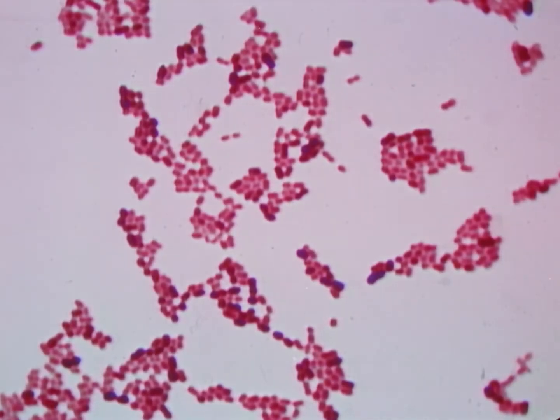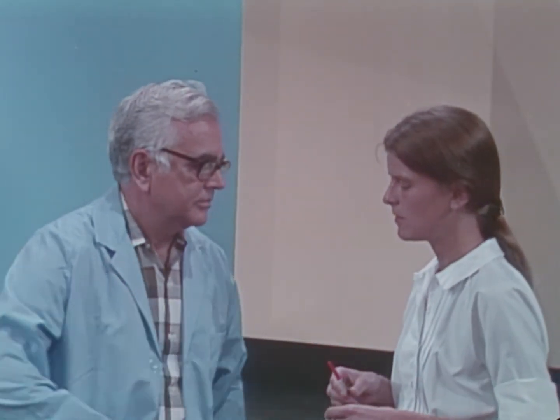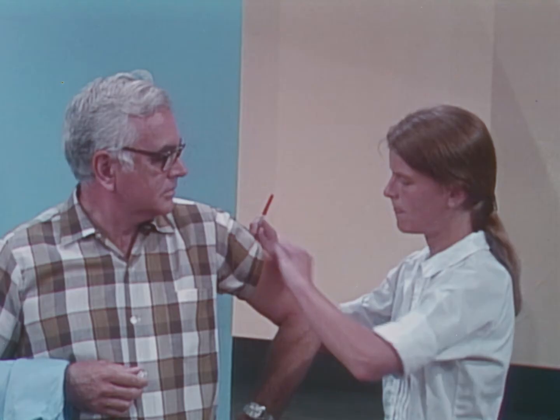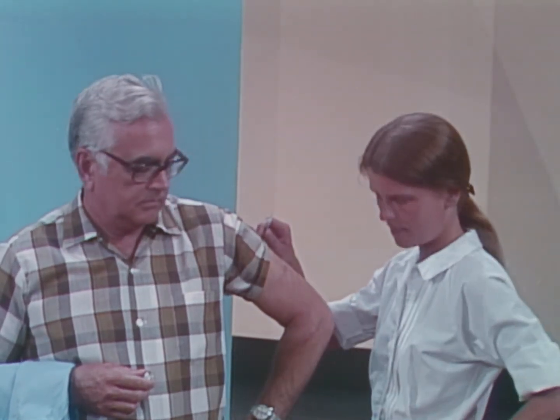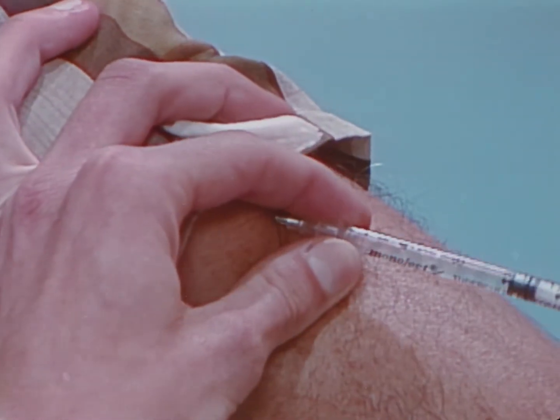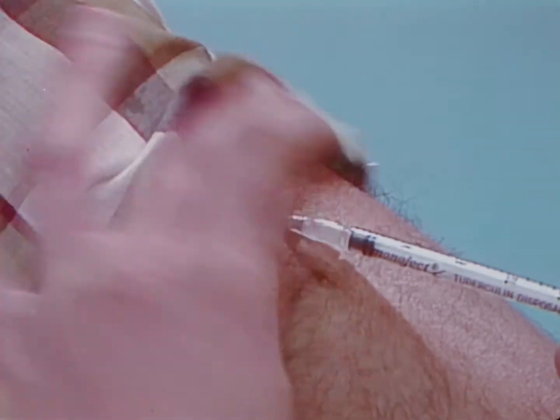When considering virulence, remember that some infections may be initiated with 1 or just a few organisms. Others may require large inocula to initiate infection. Finally, host susceptibility will determine the severity of the illness resulting from infection. Increased resistance to infection can be achieved through vaccination. We must assure that personnel are properly immunized.